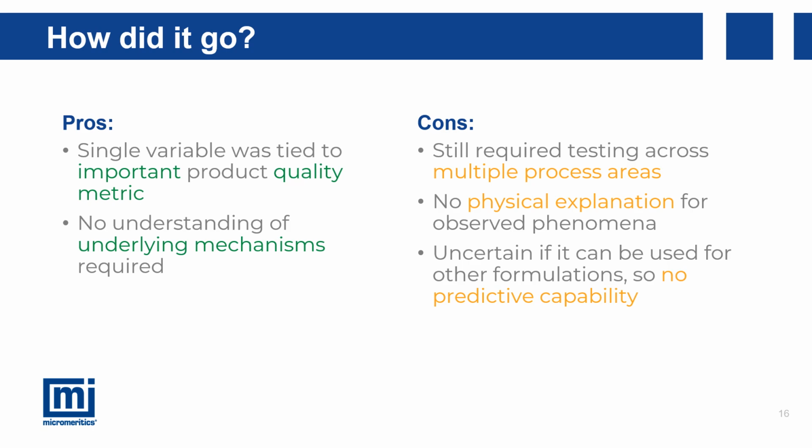So, we were able to see a strong correlation between a single powder property and our final tablet quality, which is great. However, was the testing scheme we used the best for that process? We can speculate as to why BFE is linked to tablet hardness, most likely because the flow energy of a powder tends to rise with packing efficiency, and an efficiently packed powder is less likely to contain weaknesses and defects when it comes to the compression stage.